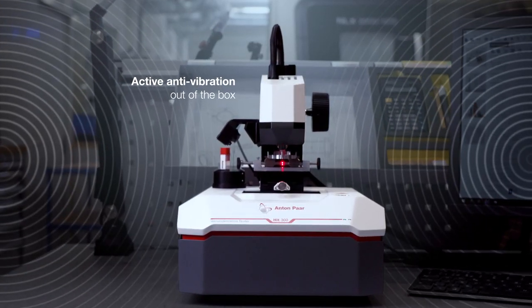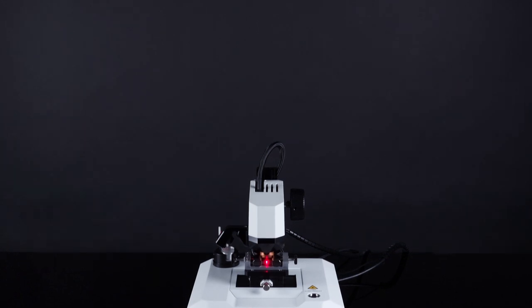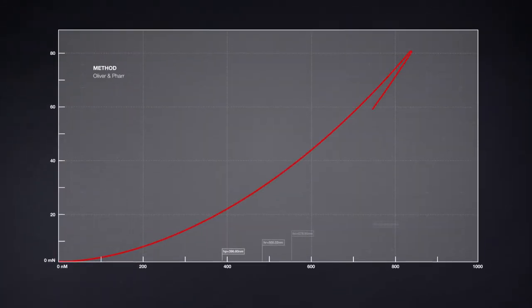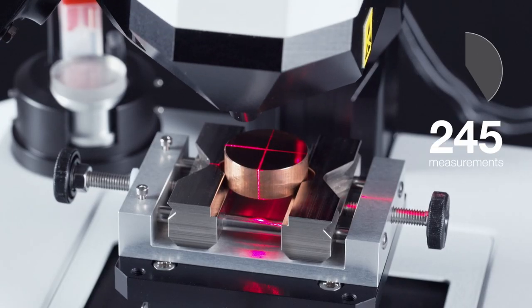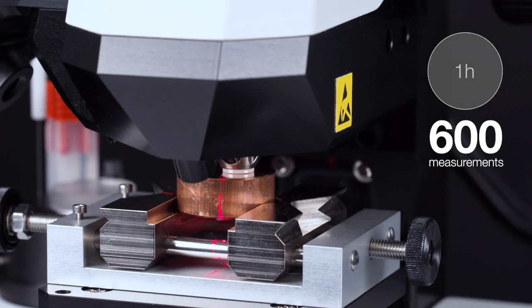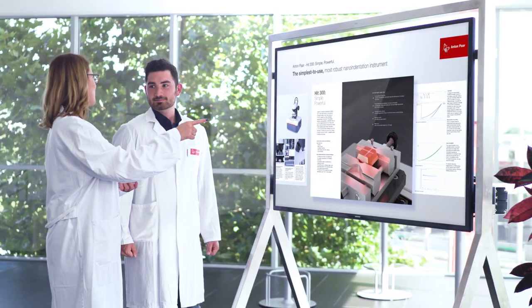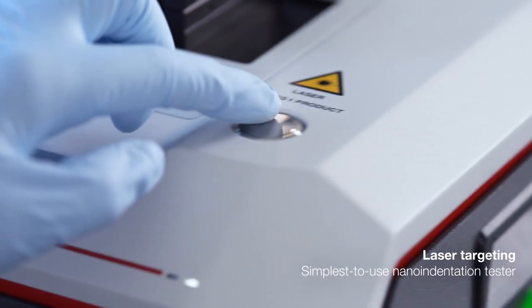Foundry-busting science brings busy days—busy for you, busy for HIT. 600 measurements in one hour? No problem. High HIT throughput means more time for you and for your colleagues.